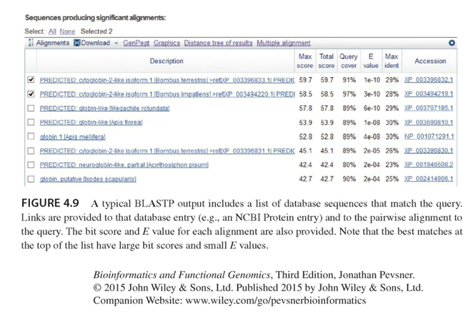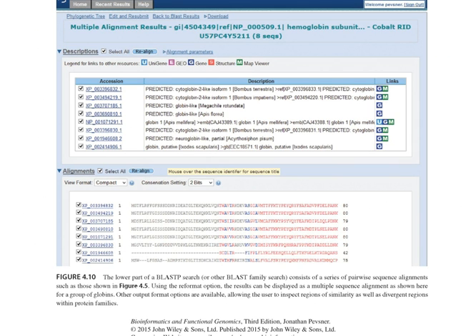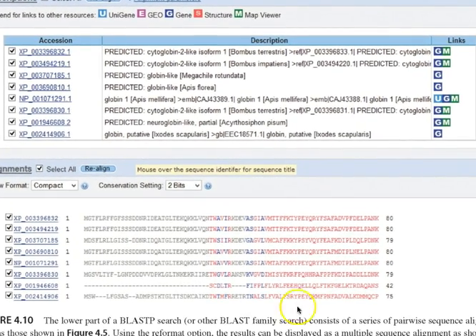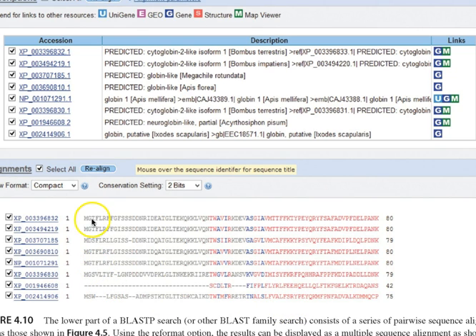Start putting it together, and what you can see is when you line them up, notice what they did here. It's the lower part of BLAST-P consists of a series of pairwise alignments, and you can reformat the option so you can actually see who's aligned and who isn't. So they selected all of these, and then what they did is they said, show me the alignment. Let me blow this up so you can actually see what they did here.